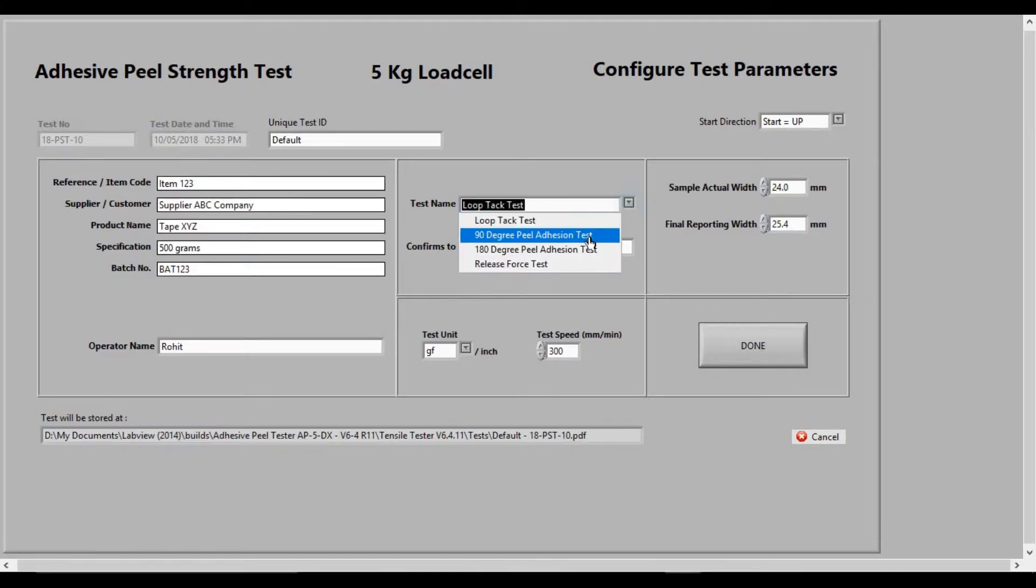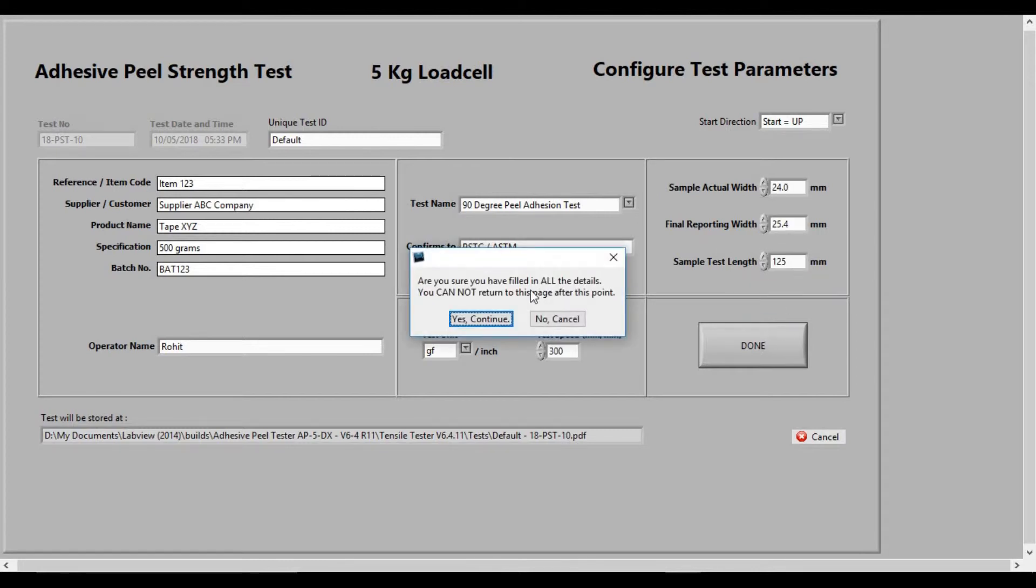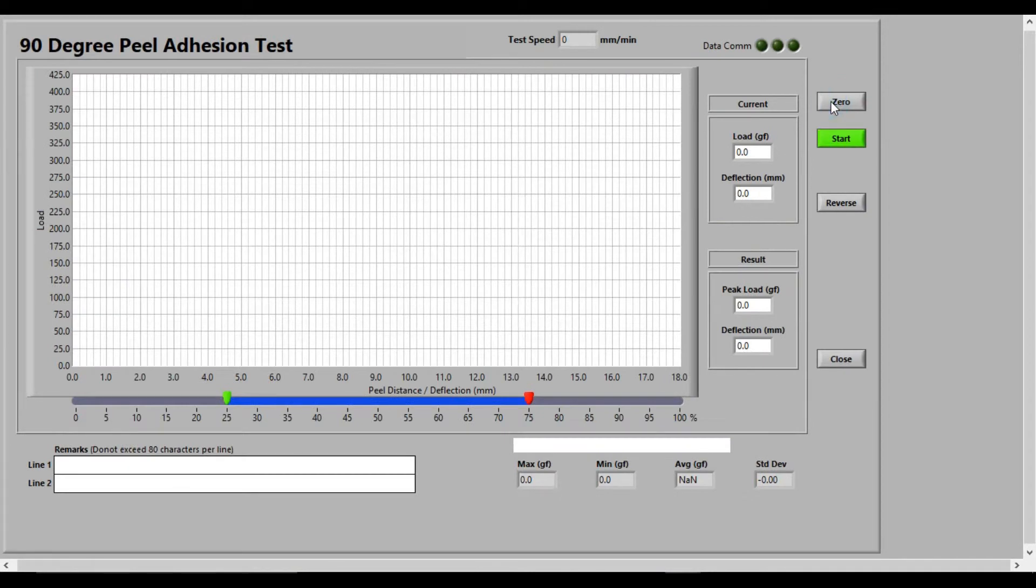Fill up the information as shown above. Press done and select continue. Press done and select continue, then start.